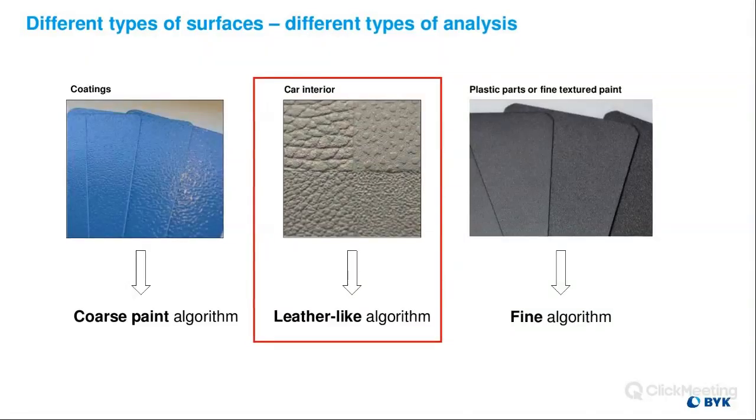So now that we have all of these measurements, we of course need to have handy and easy ways of analyzing these surfaces. You don't want to have to look at a topographical map of every surface that you produce in order to figure out if it's consistent or not. So there are specific algorithms designed for different types of materials to analyze different attributes and reduce those pictures into numbers that are going to help us compare different surfaces and the visual effects that we get due to the structure.